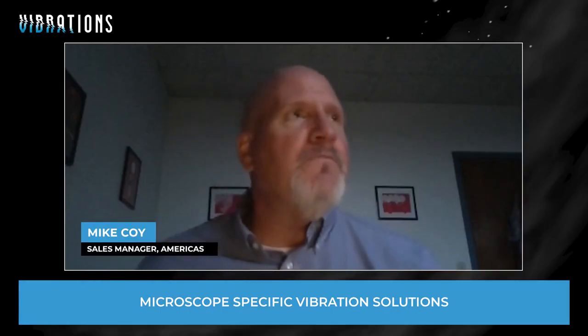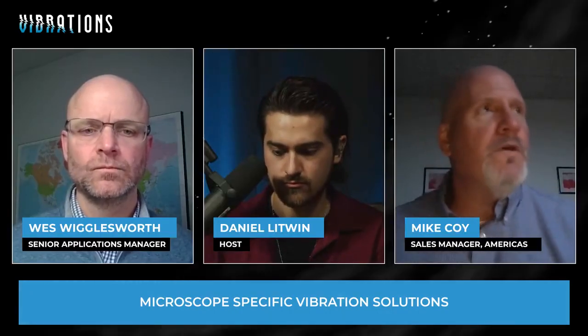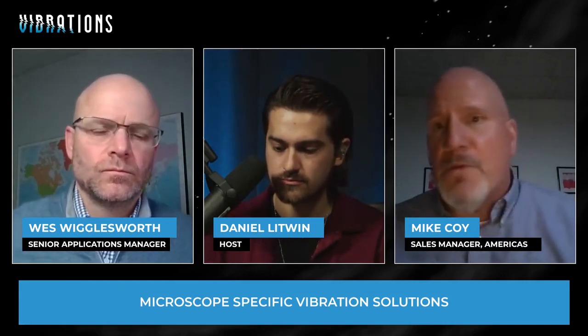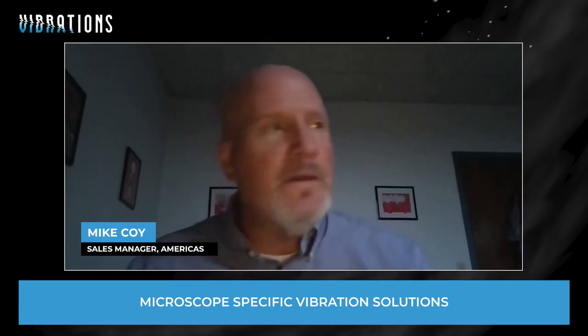So fortunately, the microscope vendors all understand this. They want to get in early as well, or they want to send us in early as well, because the last thing anybody wants is to deliver a multi-million-dollar tool and not get the performance, not get the solution we were hoping for. So as early as possible, right? And I like it even when people are applying for funding. Reach out and tell us you're thinking about buying a microscope, and let us come in and talk to you and look at the facility and look at the options for where you might put it, or what possible solutions are there.